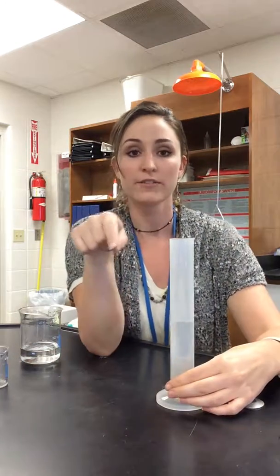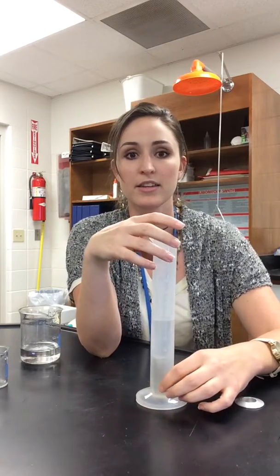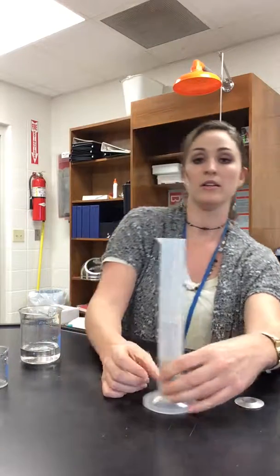So if I started at 59 and ended at 66, then I take the difference. So 66 minus 59 is 7. That means that the volume of your cylinder then is going to be 7, not milliliters because this is a solid object, but it's going to be 7 centimeters cubed.